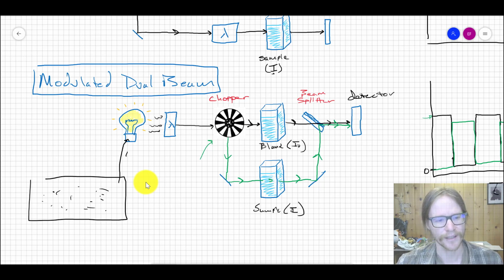and that circuit would then wire to your light source. In this case the light source is an LED, but it could just as well be anything. LEDs are nice because they have fast response times rather than an incandescent bulb, which takes time to warm up. And what you can do is build this thing called an oscillator circuit. What the oscillator circuit does is it essentially replaces the chopper. You no longer need it because it pulses the LED at a particular frequency.